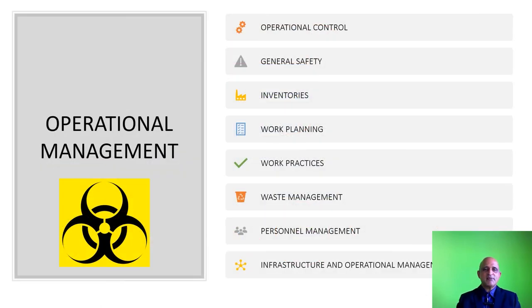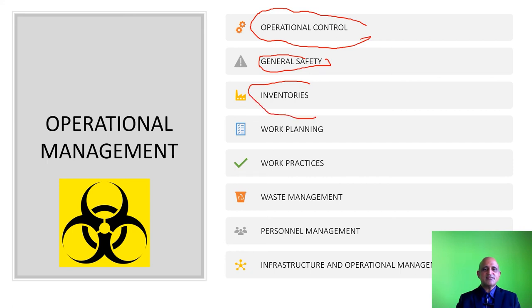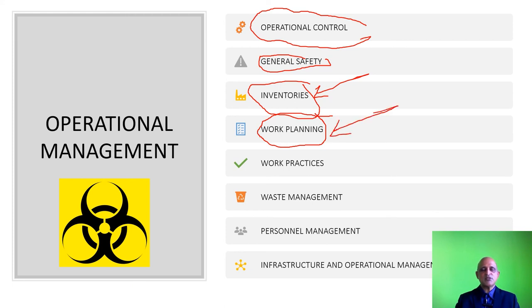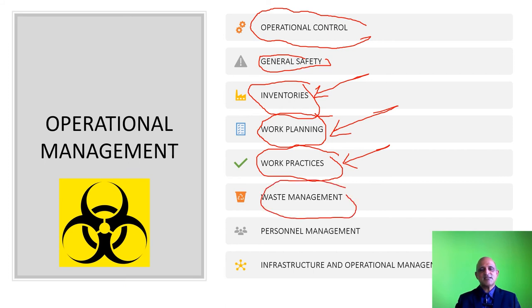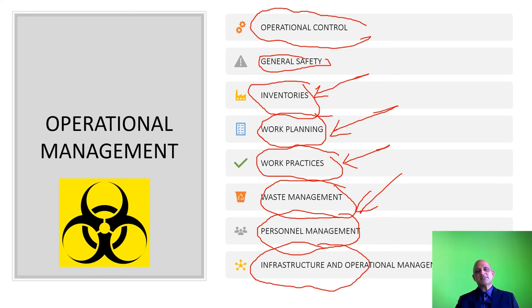We now move on to operational management. Operational management involves operational control, general safety, and management of inventories — which is very important for biosecurity, as you must maintain inventories of all biological agents being stored or processed at your facility. It also covers work planning, assigning work within the capacity of individuals both intellectually and in terms of psychomotor capacity, work practices and best practices in the workplace, waste management, personnel management, identifying and training personnel, and infrastructure and operational management.